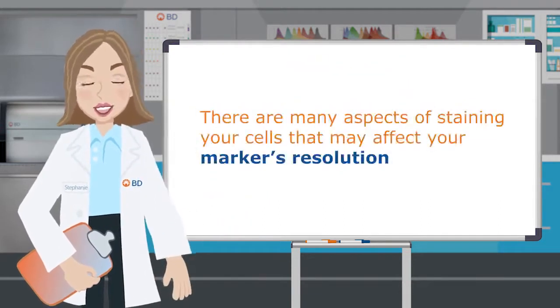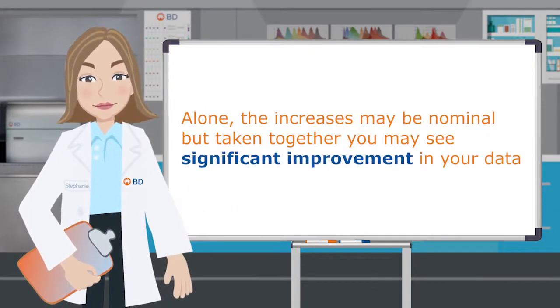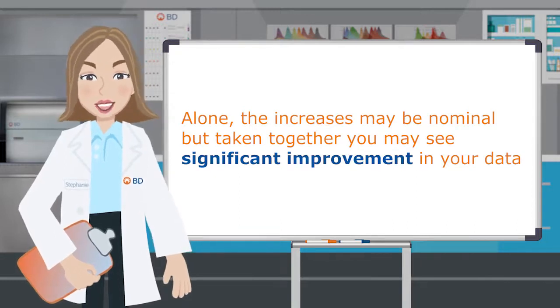As you can see, there are many aspects of staining your cells that may affect your marker's resolution. Alone, the increases may be nominal, but taken together, you may see significant improvement in your data.